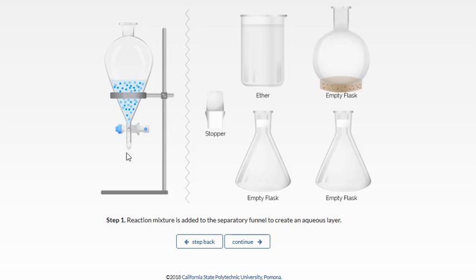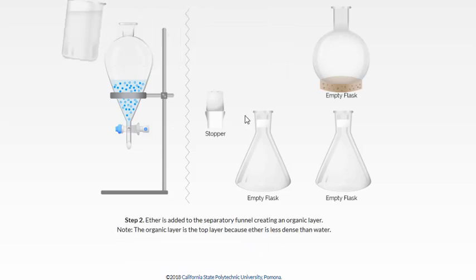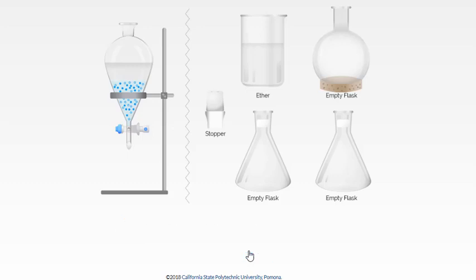It's really good practice to have a flask underneath just in case anything drips — sometimes your stopcock is loose and things might drip even though it's at the closed position. So we're going to add our aqueous layer, then take some pure ether and pour that in. That's going to create a top layer, and then we're going to mix the two layers.